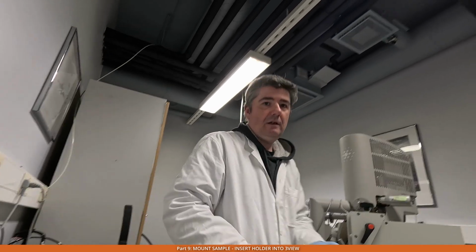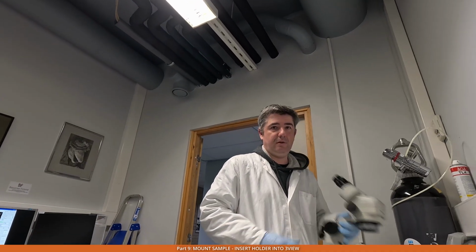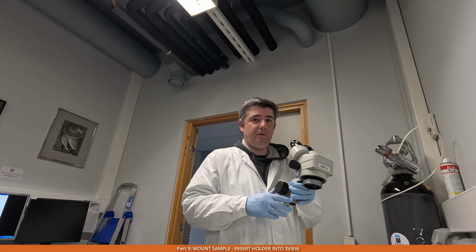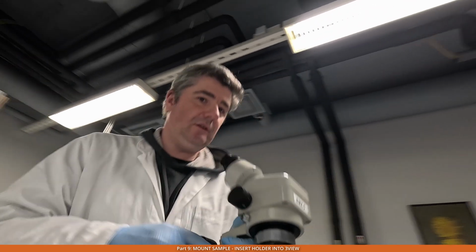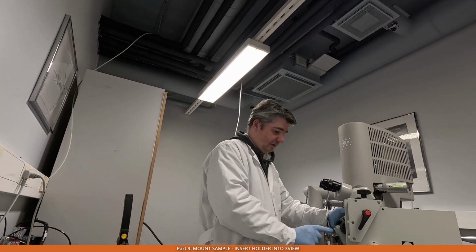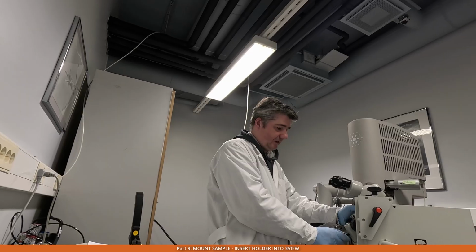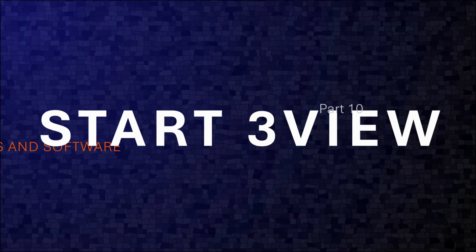Right. And then after that, I can take the same stereo microscope that we used to align the sample on the holder and put it over that thing which I put on the door, like this. And this time you really need to tighten this black screw to make sure that it sits properly attached.